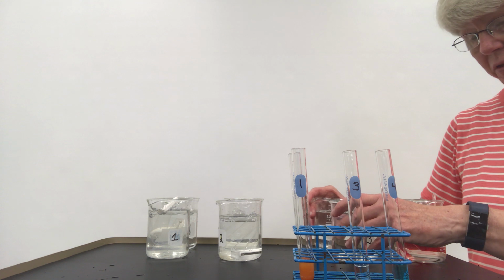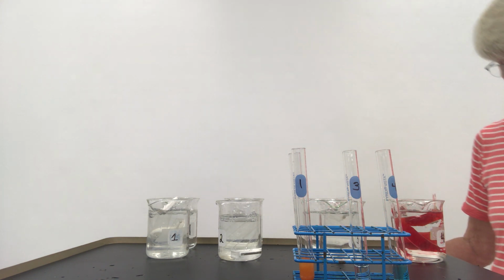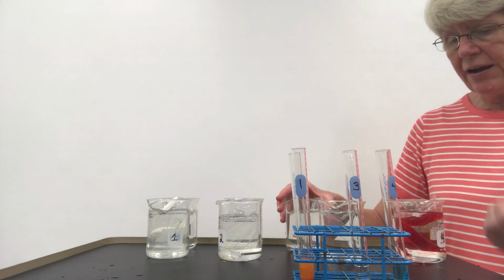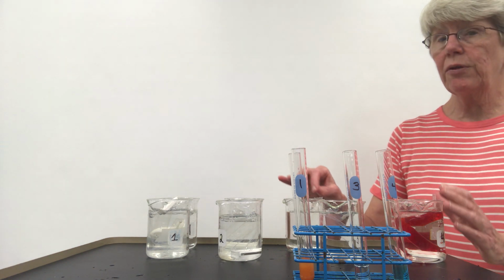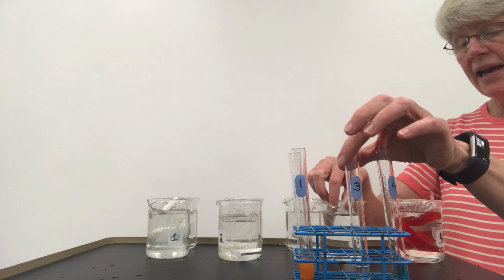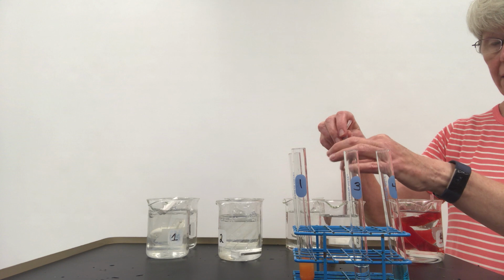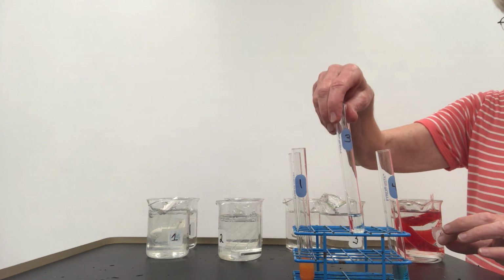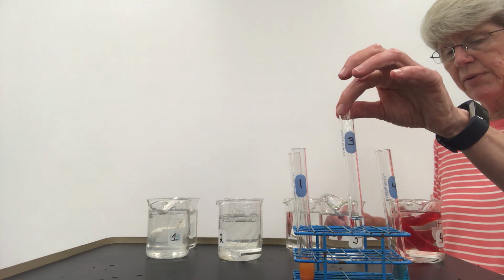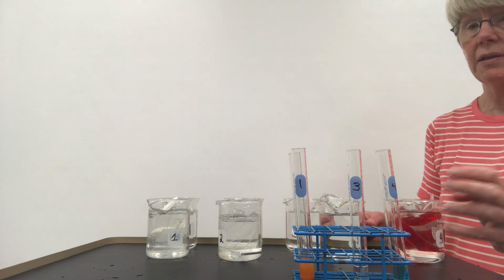For test number 3, I wonder where my silver nitrate is. We're going to test for the presence of the sodium chloride to see if the sodium chloride moved out. And with that, we will test some of the solution in the beaker because the sodium chloride started in the sac. We're going to put a drop of silver nitrate into that test tube that we have with the fluid in it, and we'll see it will change into a white precipitate.